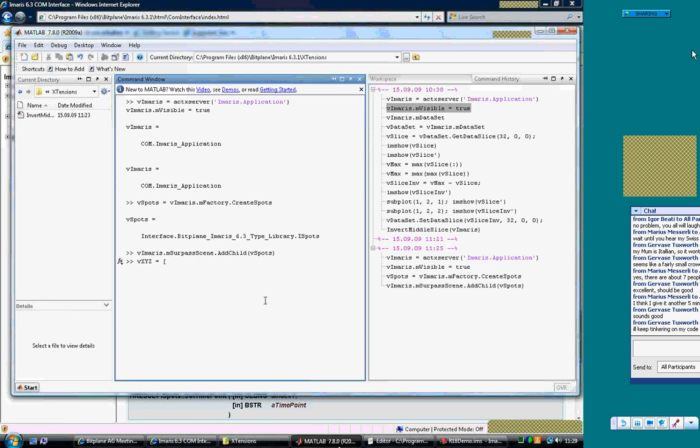We can set the position 10 on x, 10 on y, and 0 on z. Then the second line, we specify the values for the second spot. We can have the same x value, but have it above, and then the same z coordinates. Then we need to specify the time points. We have to provide 2 time points, 2 times the first time point, and the first is 0.